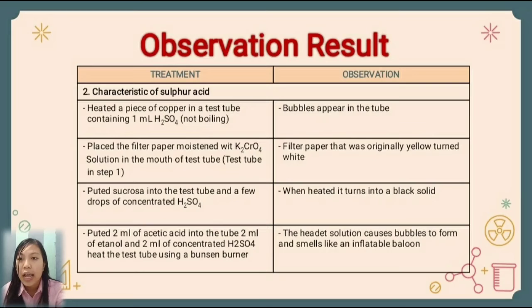Three: put sucrose into the tube and a few drops of concentrated H2SO4. Observation: when heated, it turns into a black solid.